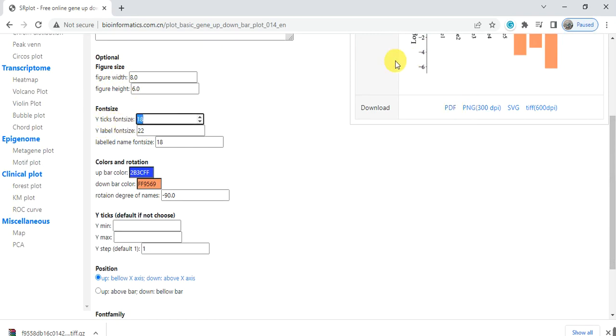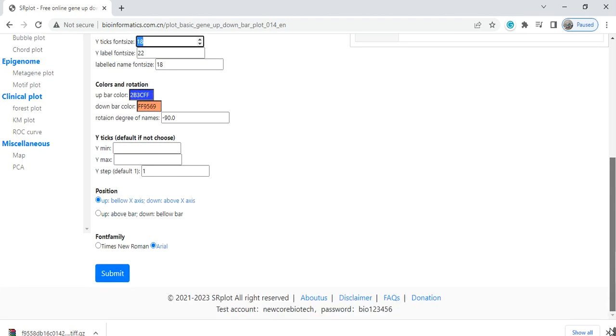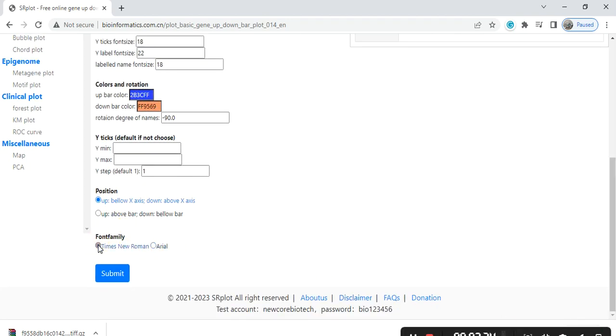Here you can change the color of positive and negative bars which you want to give, either keep it as default or change it like this. And from here you can also change the font of Arial or Times New Roman and whatever, and then click on submit.